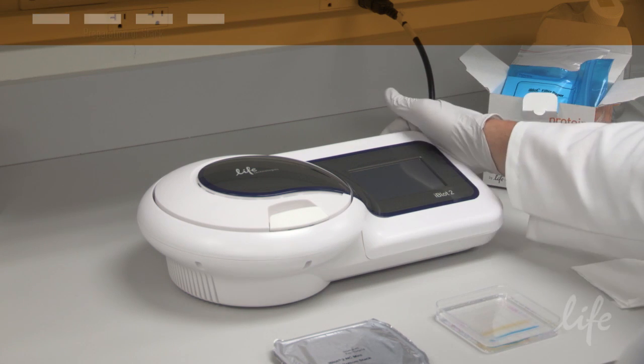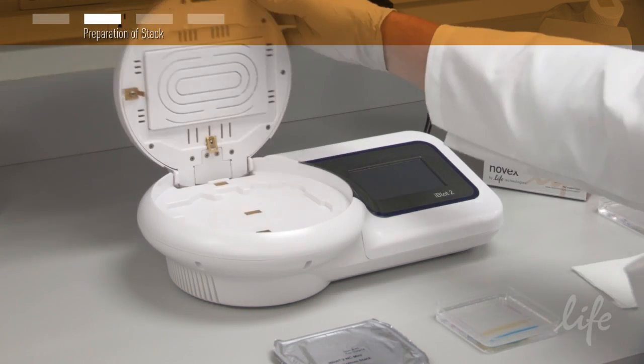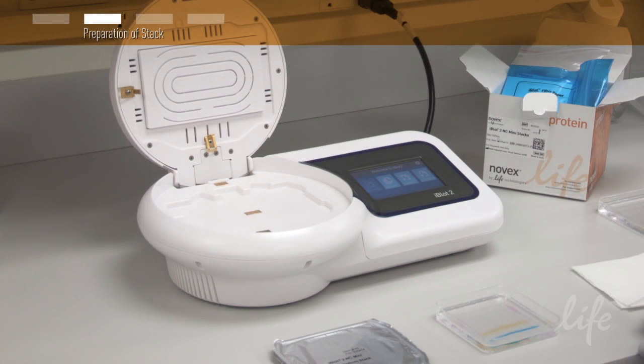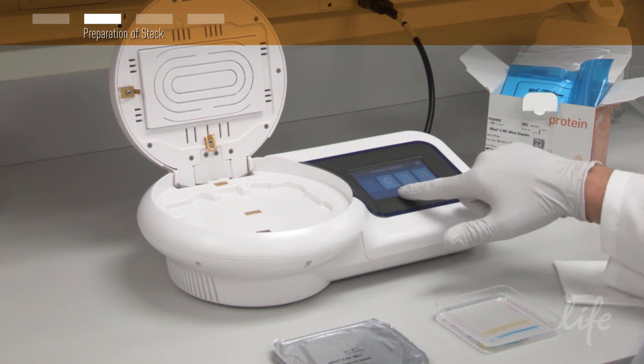To get started, power on the iBlot2 dry transfer device and open the lid. The digital display will show icons for the available actions.